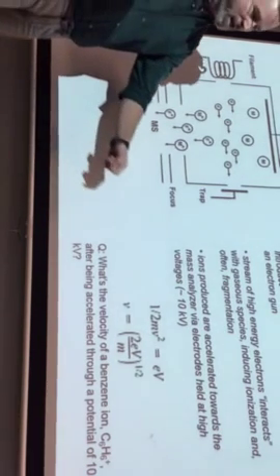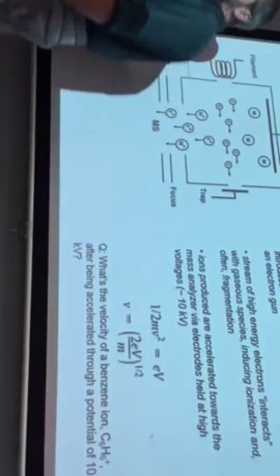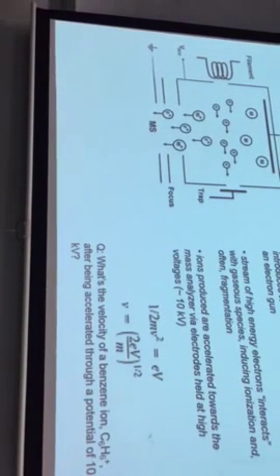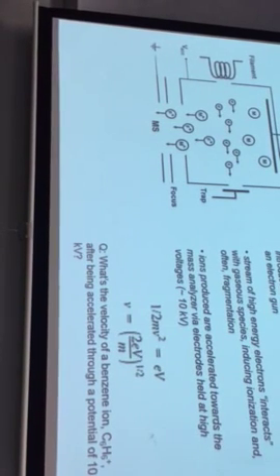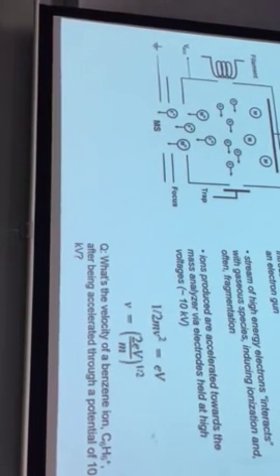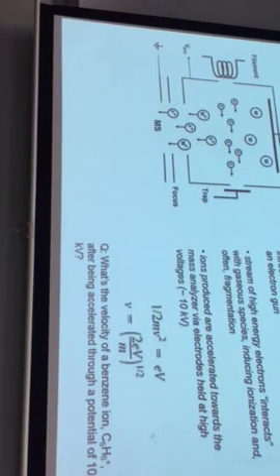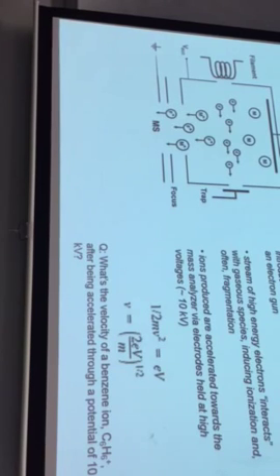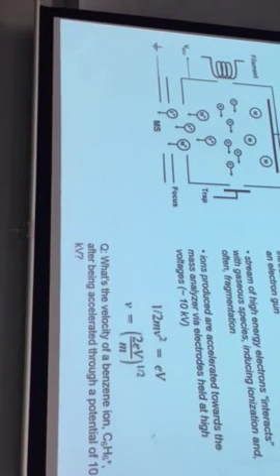You want to calculate a velocity. So that's the square root of 2eV over m. Great, 2 I'm good with. e, what is that? That's electronic charge. Coulombs per what? Just coulombs, right? Yes. And what about V? Voltage. A volt, by definition, you guys might be aware, is a joule per coulomb. Great, now I've got a joule.